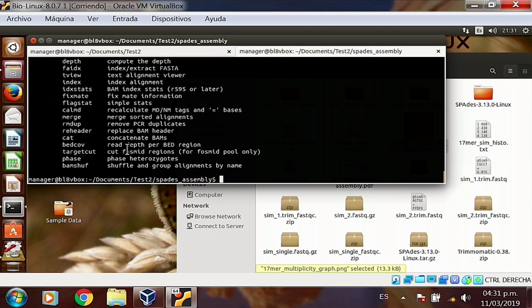It's meant to help you understand alignment formats, and to give you quick access to random parts of your alignment file. We haven't done an alignment. We have a reference genome that we've just produced. But in other tutorials, we're going to teach you how to create an alignment.